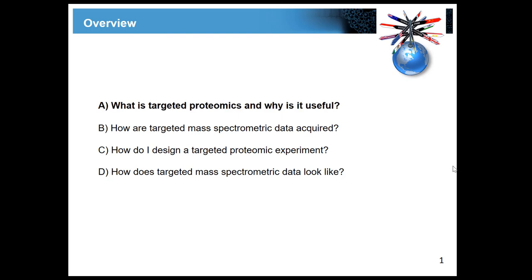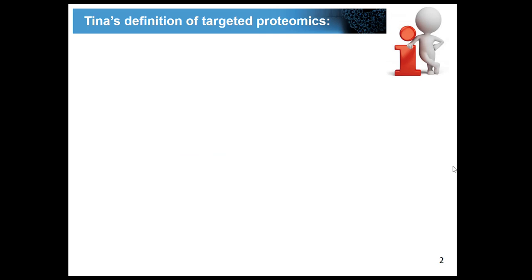Okay, so let's get started with what is targeted proteomics. When I prepared this presentation, I tried to find in the literature the definition of targeted proteomics. And what I realized is that this is actually quite difficult, because when you look at how different groups define targeted proteomics, you will see that they use this term in quite different contexts or in slightly different meanings. So what I decided to do is make my own definition of targeted proteomics.